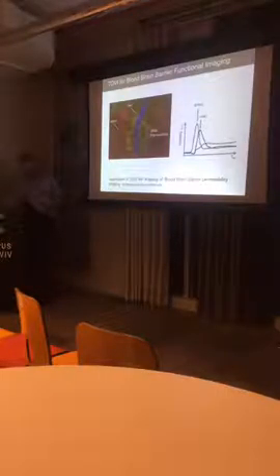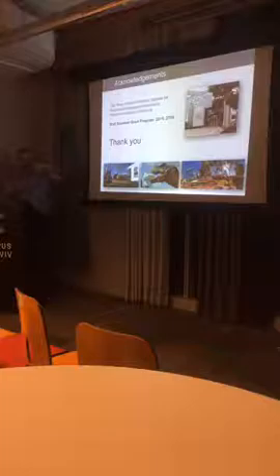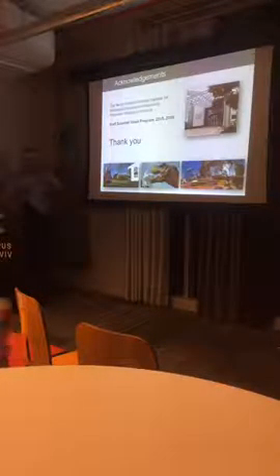Sometimes we switch filters, but now we can also use combined cameras, one camera for speckles and one for fluorescence. And if we use one camera, we do an iterative process. We can synchronize fluorescence, then speckles, fluorescence, speckles, or first we do speckles in order to navigate where we are. We get the picture of the speckles, and then we use fluorescence in order to get a final nice picture. And then we can combine them, overlay them.